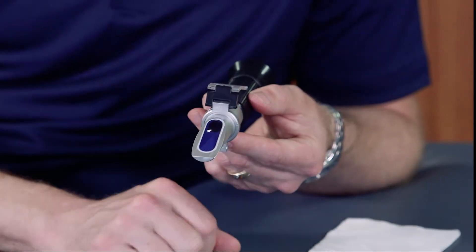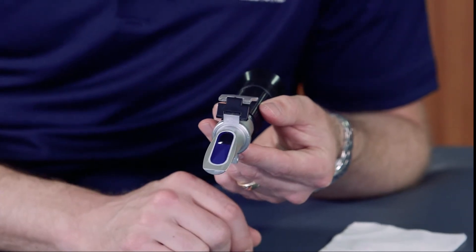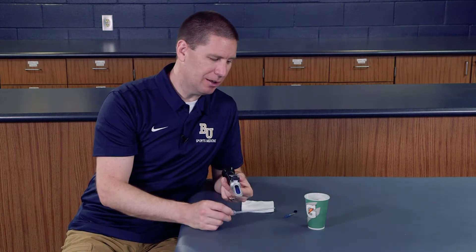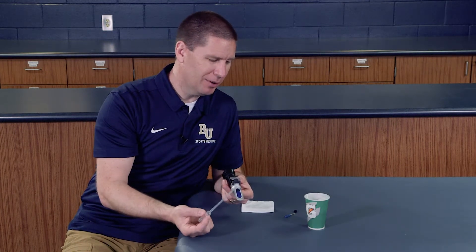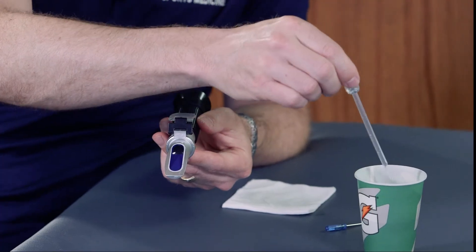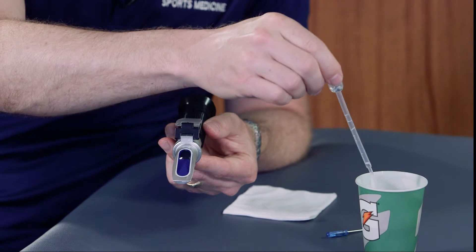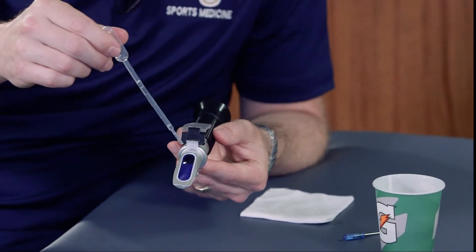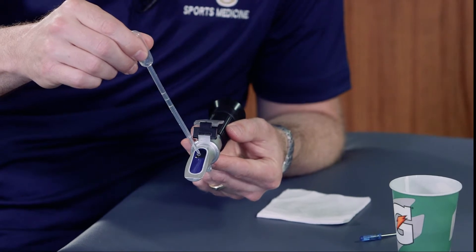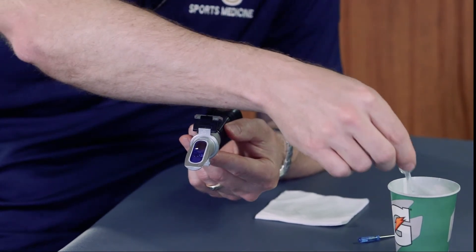Once that's done, you would wipe off the distilled water and then it's ready to test our urine. You have your athlete give you a urine sample — we've got it here in our cup. I'm going to use this small pipette to drop a little bit of the urine, just a couple of small drops directly onto the prism.